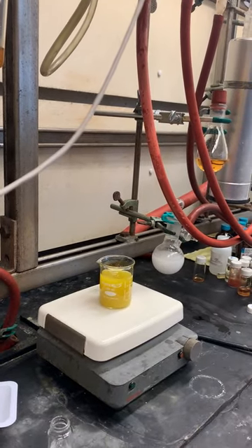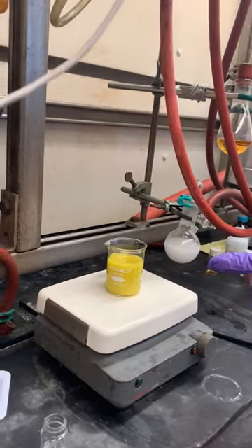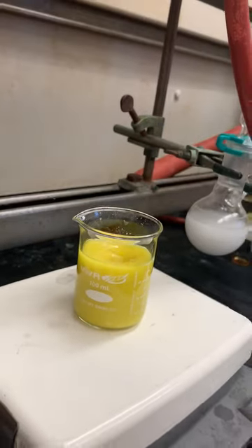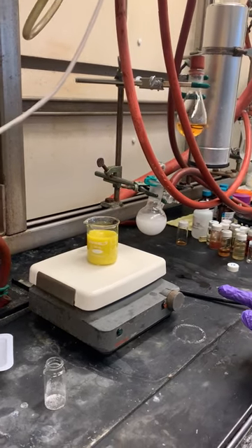Depending on how concentrated it was, you may see all the solids dissolve or it may stay as a suspension for a little bit. You can see a lot of precipitate just formed — it's kind of like a powder now.